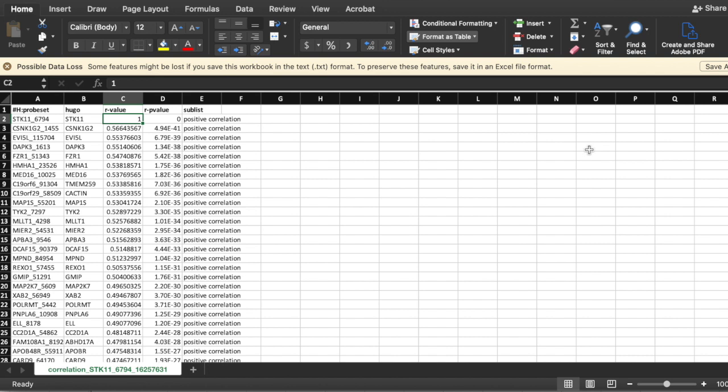These are STK11's super friends. So what do you think most of these things are, good people or bad people? Are these cops or robbers? Positively correlated to STK11. Cops. Totally. Yes. Not only are they cops, but they're probably doing something, they're helping STK11. The thing is, if I can study these things that are like STK11, that behave just like STK11, I can get a very good idea of what that thing is doing in my system.